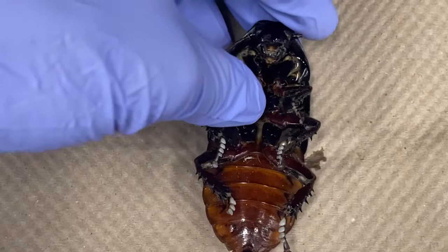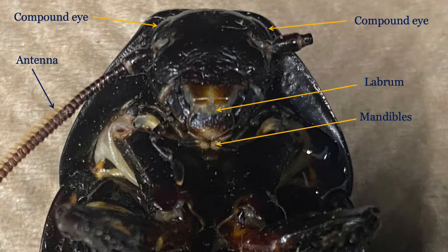Let us turn the cockroach over and take a closer look at the ventral side. Beginning with the head, you should be able to see the antenna, compound eyes, and some of the mouth parts. In this diagram, the labrum and mandibles are identified. The labrum acts like an upper lip, while the mandibles are chewing structures similar to the vertebrate jaw.